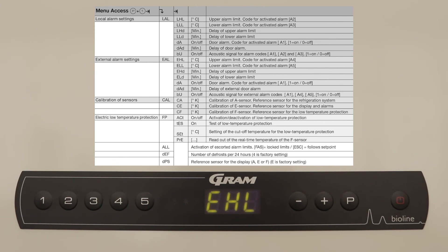External alarm settings refer to the settings of the voltage-free contact if connected to a central alarm system. This will allow for remote alarms should your unit fall outside of the set external alarm settings.